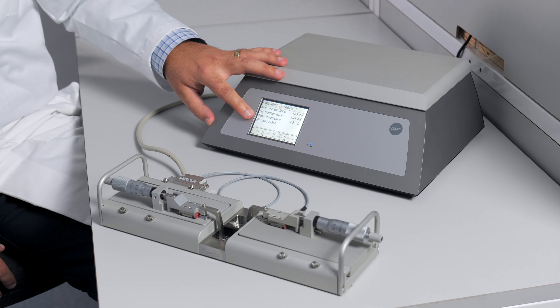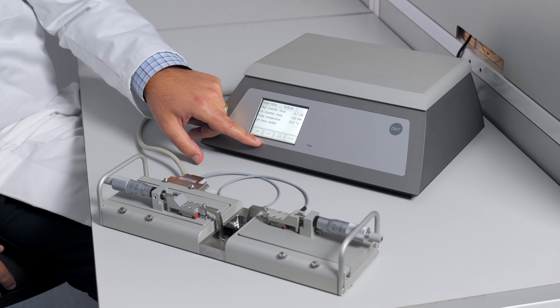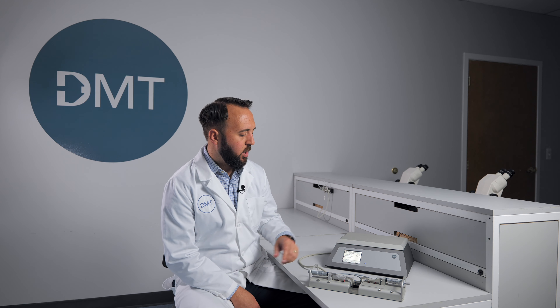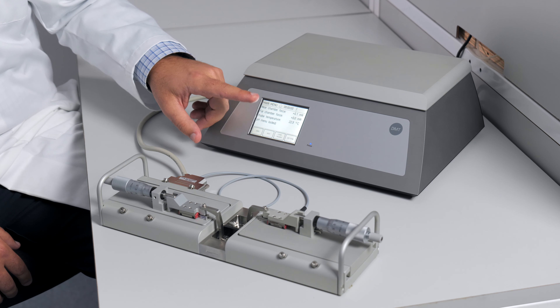You will also use the touch screen to zero the force reading from your transducers, turn on heat in the chamber, as well as perform the force calibration procedure, as well as other functions that are housed in the interface. When making your selections on the touch screen, just use your fingers and not pens or other lab tools.